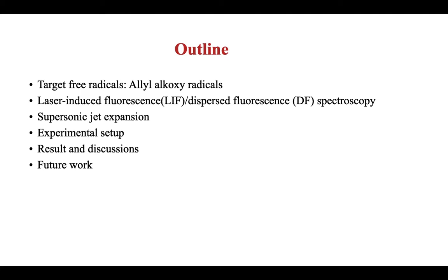Here is the outline of my presentation. At first, I will give you some idea of free radicals and how we produce allyl alkoxy radicals in our experiment. Then I will move forward to the principle of laser-induced fluorescence and dispersed fluorescence spectroscopy technique.